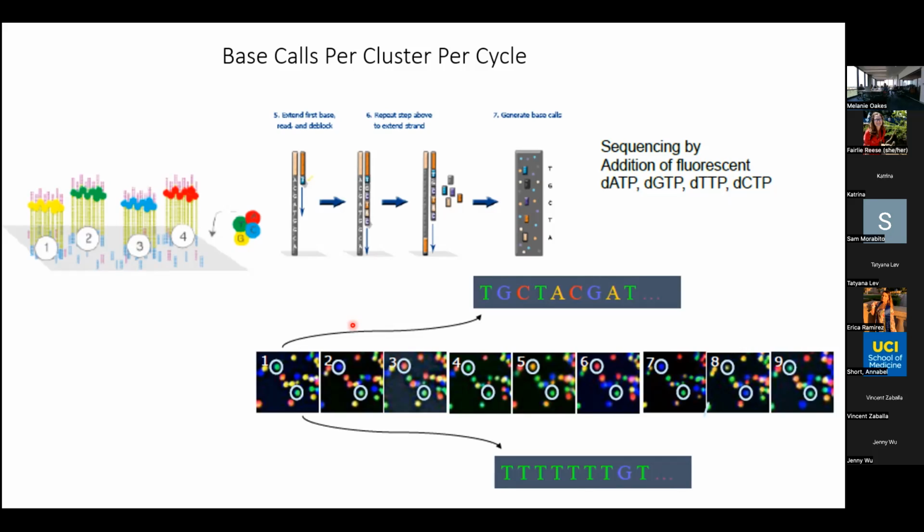I'm putting everything as much as possible on this flow cell in the core. And the reason why is that Illumina gives us a 40% discount on this flow cell only, okay? The other ones have a discount, but not as much as this. So this is the cheapest sequence, the money per base is on this flow cell. So like 20 million reads is probably going to be, I don't know, 34 bucks, okay? So this is why.